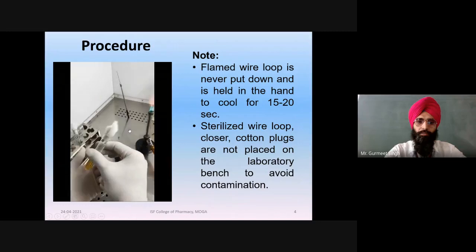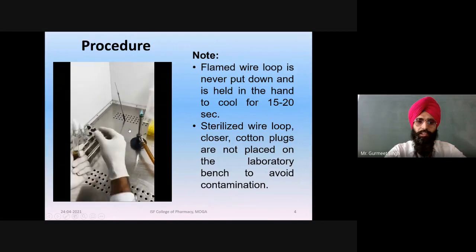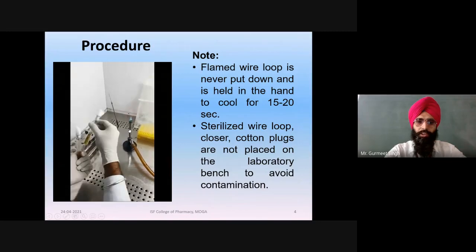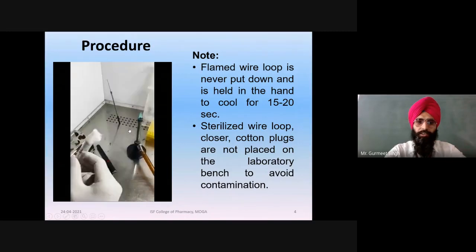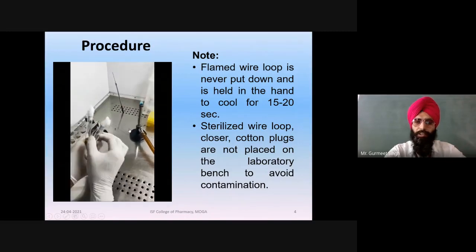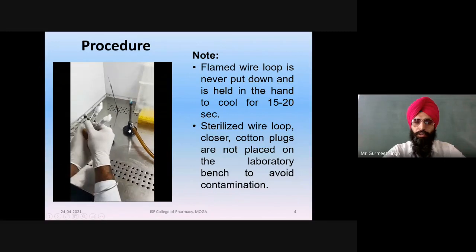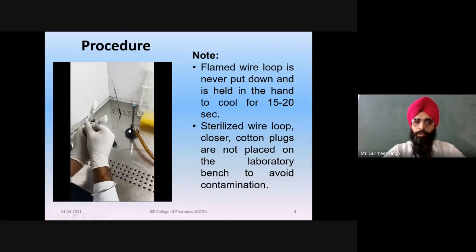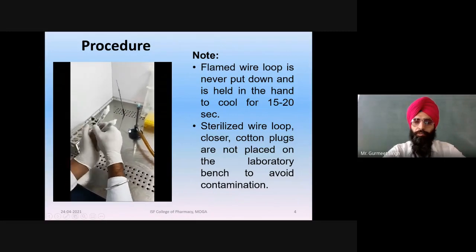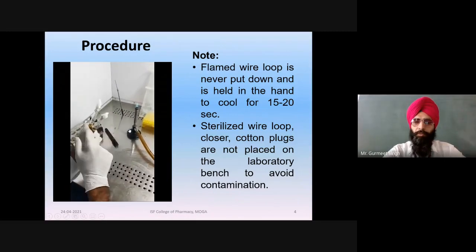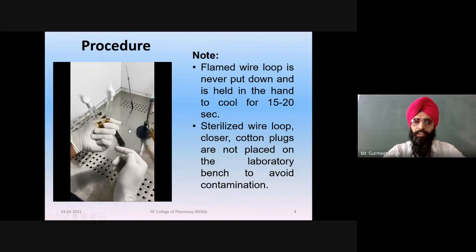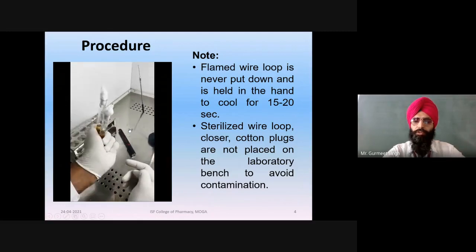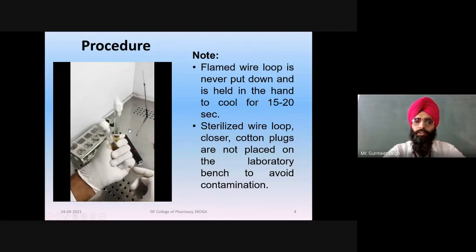This tube is the bacterial suspension and this tube is called the subculturing tube. Place the tubes in the palm of the left hand and separate the two tubes to form a V-shape structure.